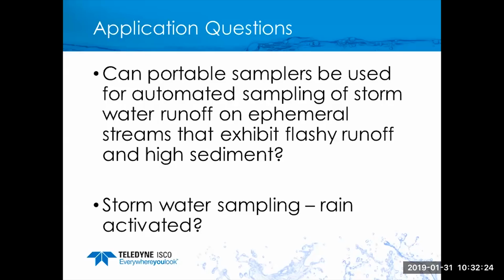Pump flow applications are very similar, where you may have a line downstream from a lift station that, on some irregular basis, kicks the pump on and pushes the flow down the pipe. When it drains the wet well, it turns the pump off, and eventually the flow subsides to nothing. So in those applications, you would want to have some sort of means of determining the presence of fluid, and not just the presence of fluid, but adequate depth to make sure that it's going to be able to pull in sample as opposed to air.